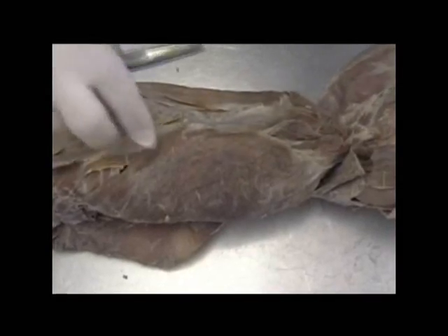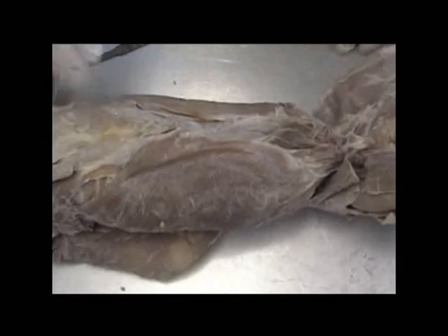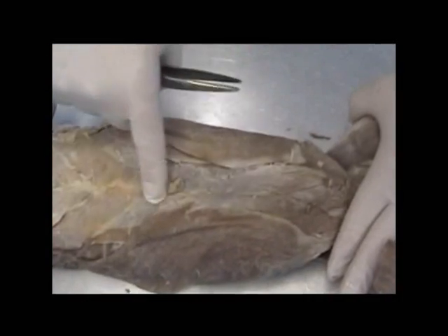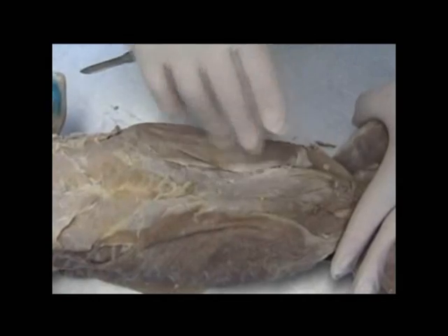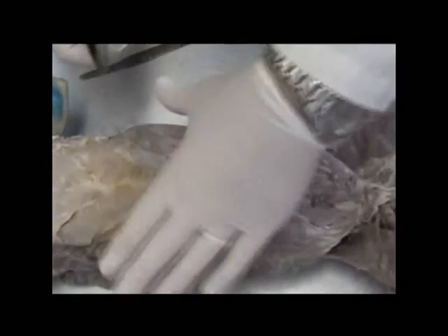Okay, we're going to continue now working in the abdomen and back up into the chest again, working at some deeper muscles up in the chest. But first of all, looking at the belly of the animal, we have this large aponeurosis, this large connective tissue sheath. There are no bones under this, and so muscles that come across have to attach to something. So we find this significant sheath of connective tissue here.